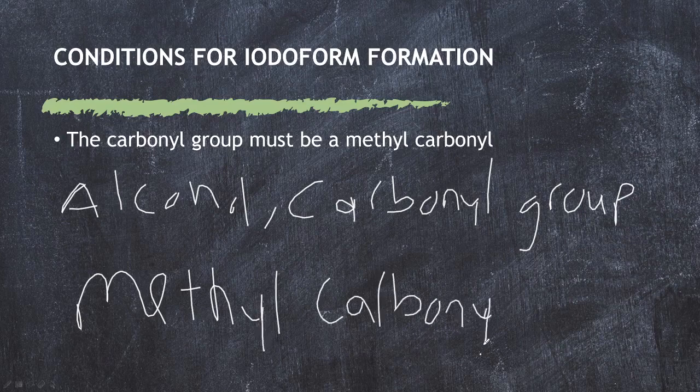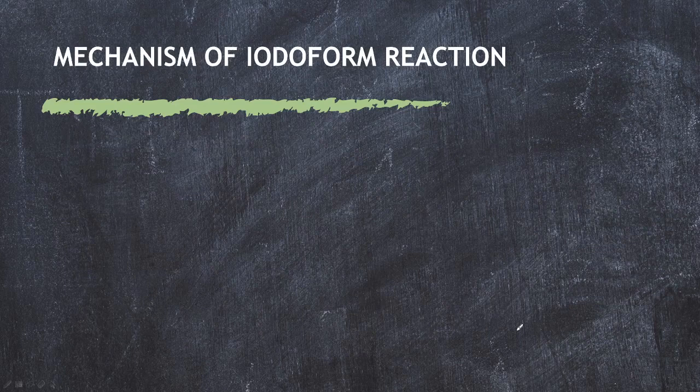So in our inference, we don't just write carbonyl, we write a methyl carbonyl present, confirmed or suspected. It has to be a methyl carbonyl.